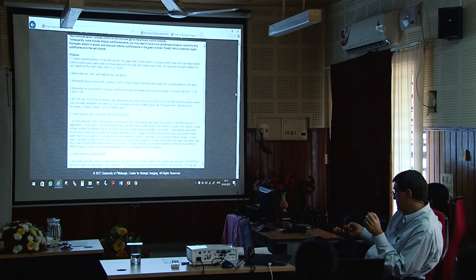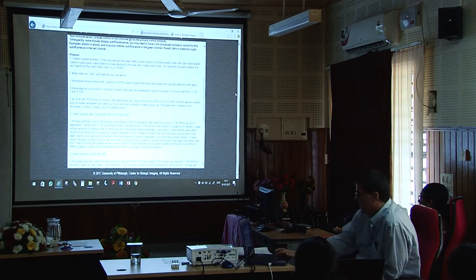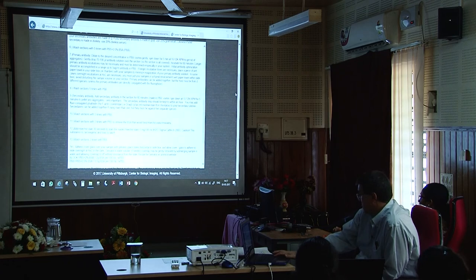Okay. Again, the idea of the secondary from the host. Again, wash. Again, primary, same kind of deal. I mean, really not much different here than with cells.